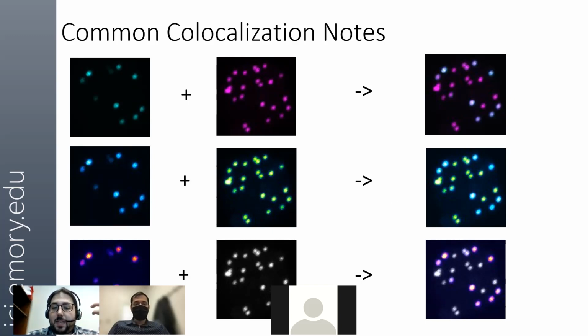So it's something to be mindful of when you're using these in your analysis or in your manuscripts. Because, for example, the top and the bottom give different impressions of which components are co-localized, which colors are changing, and how the colors are even changing.